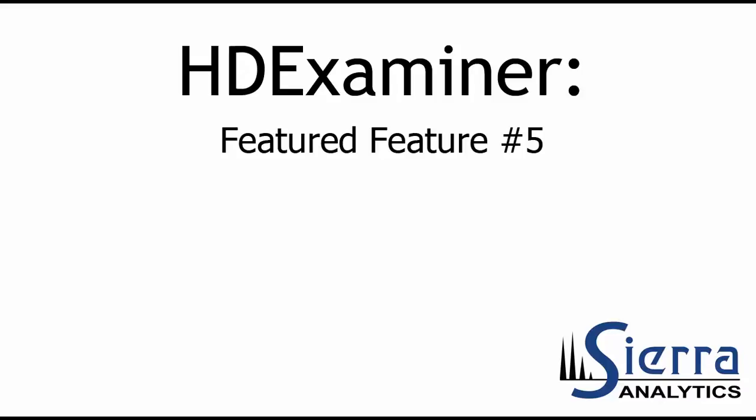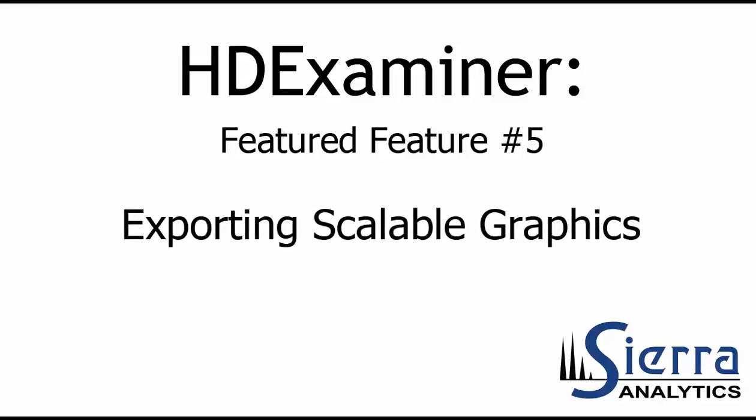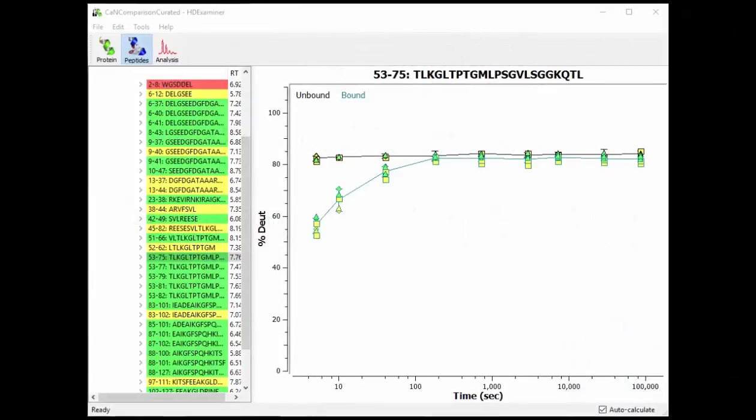So I thought I'd give you a good one today. Today's featured feature is exporting scalable graphics from HDExaminer. So here we're looking at an uptake plot in HDExaminer, and if you've ever done an export of any graphics from HDExaminer, you'll know that it saves those as EMF files.